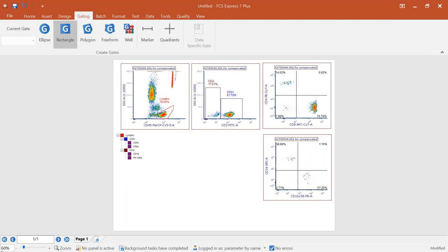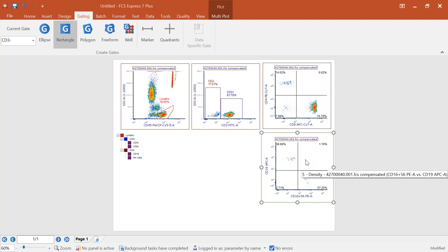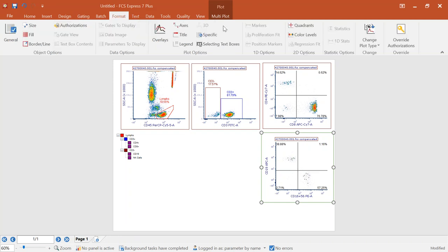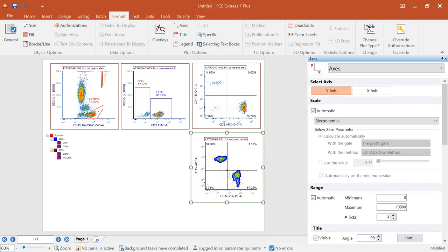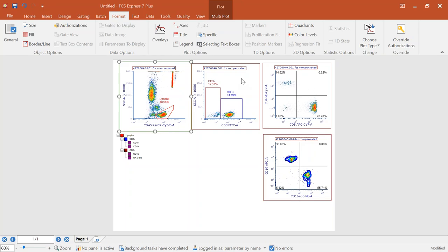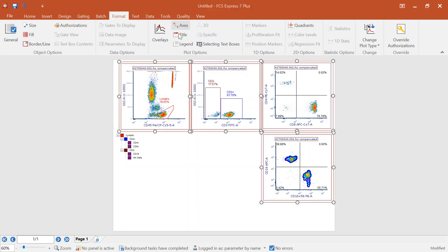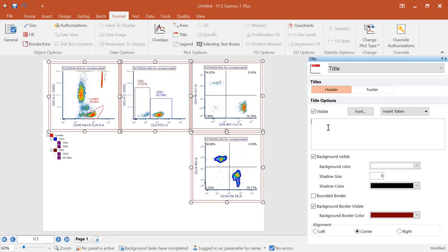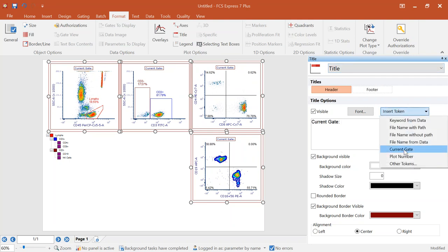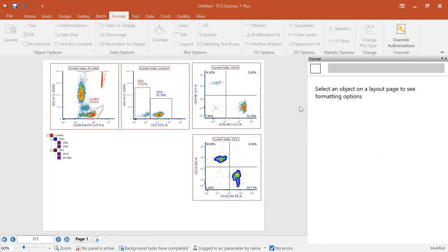Coming down here, I'll convert the upper left to our CD19s and make the lower right our NK cells. It's very quick and easy to build this up and have the hierarchy apply correctly. You may want to format these plots to achieve publication needs. In the Format tab, you can change to whatever plot type you want — a color dot plot, a contour plot. You can double-click on a plot or multiple-select plots to format information by choosing the Format tab.